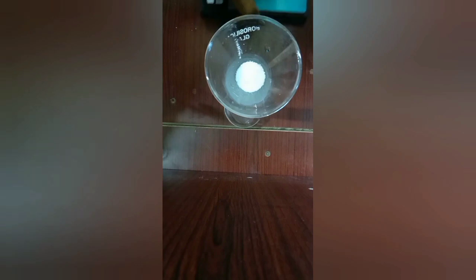In your place, you can make up this. Now you are going to make up the solution. To make up the solution, just check that here is a fine line. This is 100 ml. Up to this only, 100 ml. You are not supposed to make up more than this. If you make up more than this, another chance is not allowed. It should not be given in the examination. So be careful. So use the wash bottle. If the salt is not going, just tap the funnel gently.